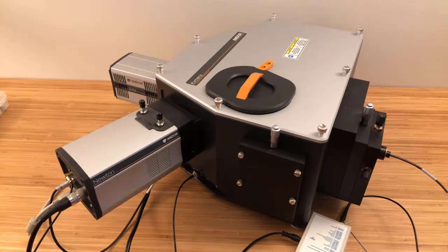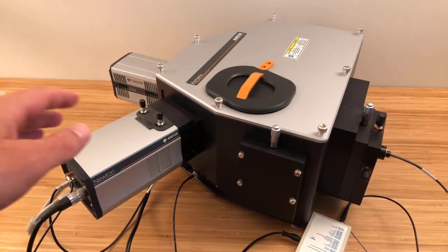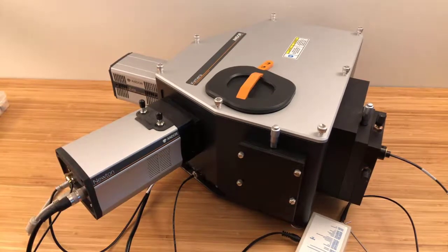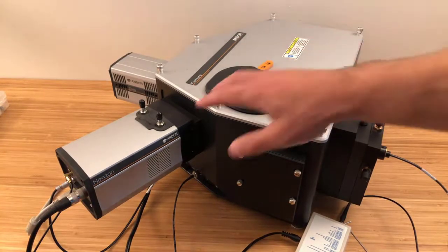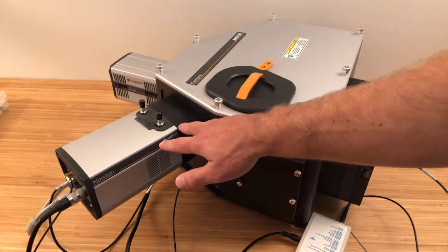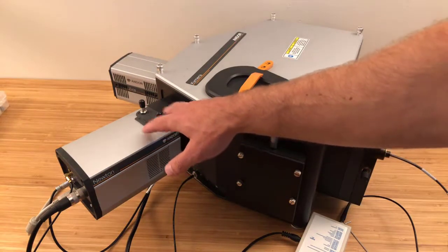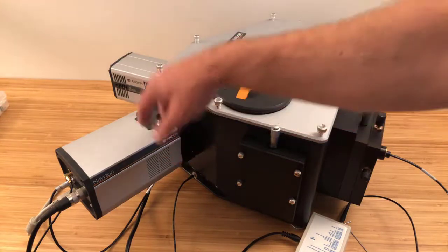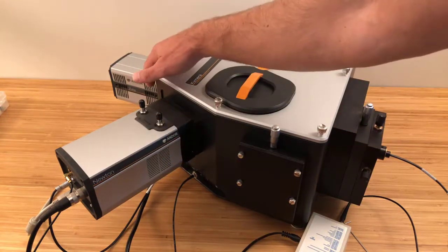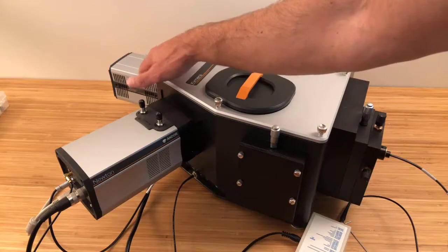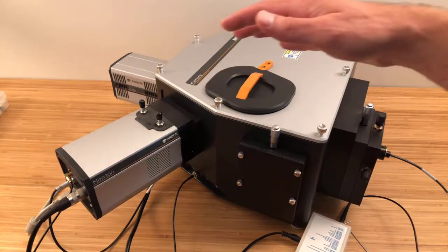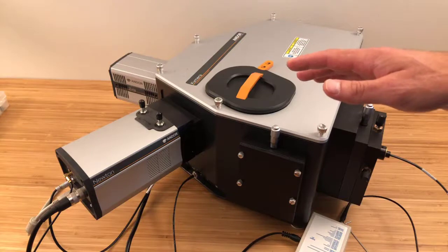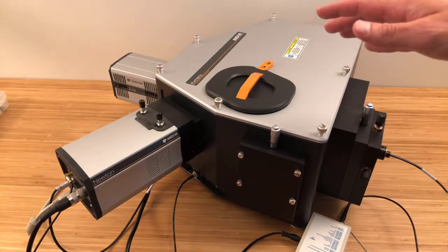And on the other end of the spectrum, we have the output ports. So that's where the actual spectrum or image is formed. So this is, on the direct port, a Newton 920 back illuminated full frame high speed CCD. And on the side output port, we have a Xyla 5.5 sCMOS camera here on the side port. I'll only be showing off some basic features of the Newton in this demo, but I have several other videos that highlight the features of some of our other cameras.